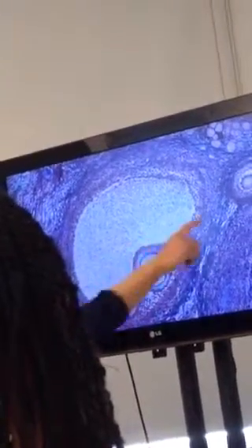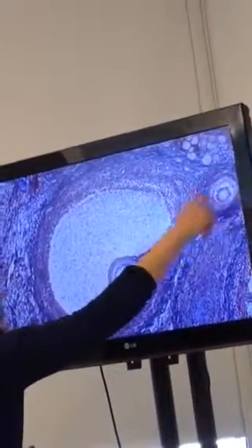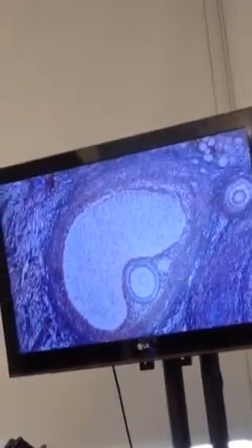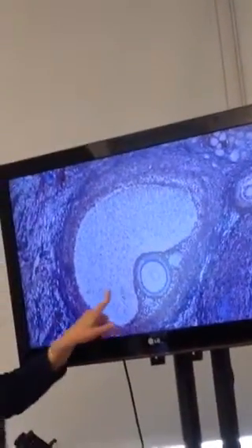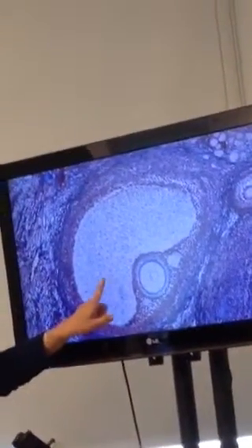What's important about the tertiary follicle is that that's the egg that's going to get ovulated. The others, like I said, underwent atresia. Oh, actually, see this over here? I don't know if you can see very well. It's starting to develop cracks in it. That's maybe a better secondary follicle than the one I showed you. The one I showed you was a little more advanced, so I'm afraid it looked a little too much like this one. But if you start seeing what looks like primary, but you see cracks in it, that's a good secondary follicle. Anyway, you see it's grown a lot.